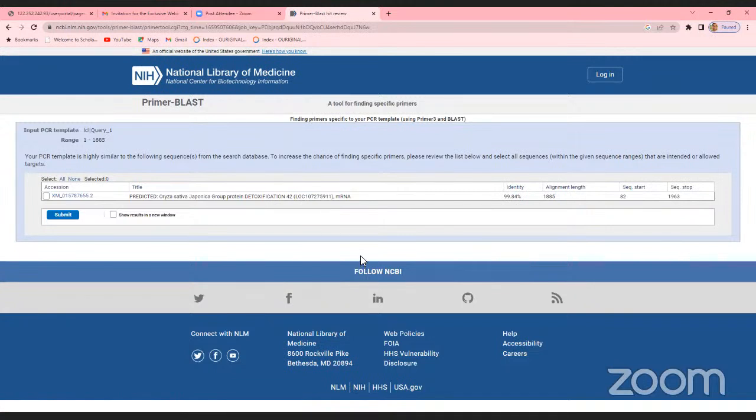So they are asking, are you using this one again? Because I am telling you it is unknown, I think it is unknown, but I have taken it from this only. So they have just selected it and I have submitted.